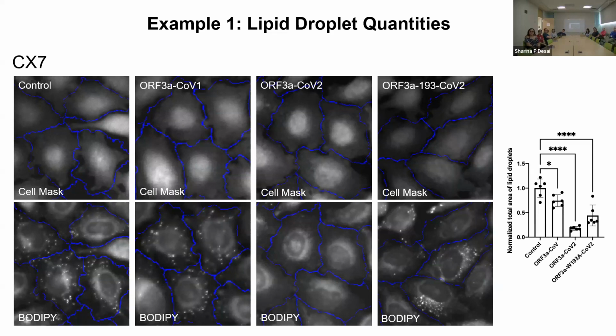And then in one experiment, you can easily do replication for 6 wells to 12 wells, or if you want, you can do a dozen wells for one condition. So for this experiment, we are quantifying tens of thousands of cells. So it's completely different from a confocal microscope. I think this is one thing CX7 is useful for.